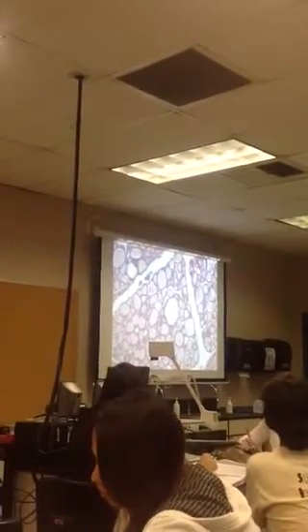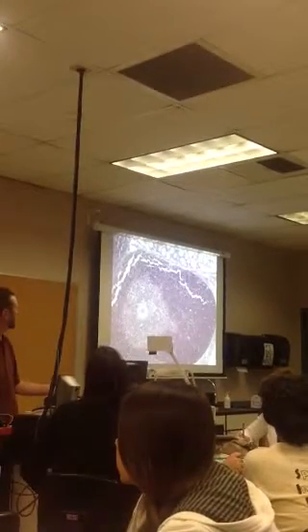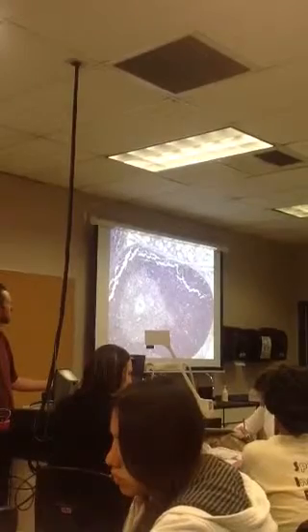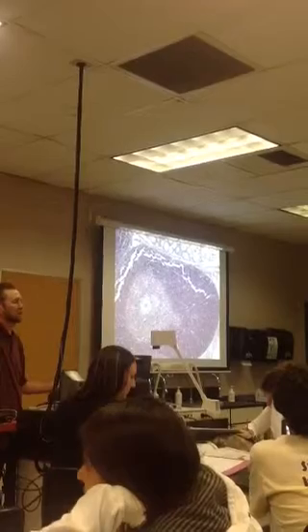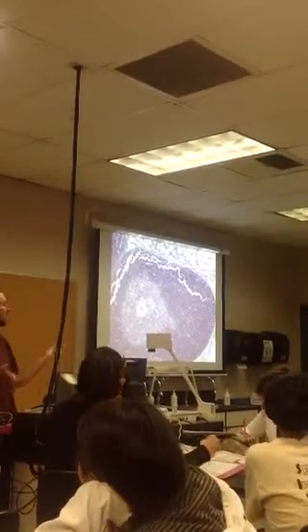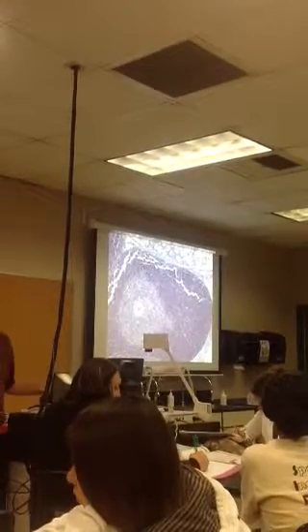Also on this same slide, as you scroll around, you're going to see tissue like this. This is your parathyroid gland. The parathyroid gland is made up of these specialized cells called chief cells that are going to produce the parathyroid hormone. Also involved in blood calcium regulation. Okay, so calcitonin and parathyroid hormone have opposing effects on blood calcium. So that's the parathyroid gland producing the parathyroid hormones.